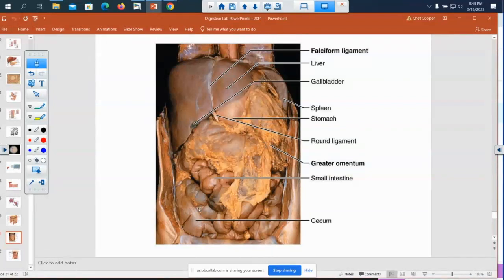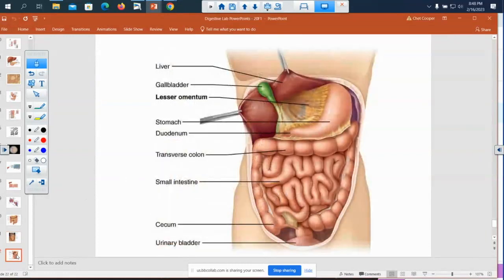Also, look how big, that's the large intestine across there. And that's the small intestine right there. So obvious why they call them large and small, right? When you see that. It would look even better if they removed all that mesentery and cleaned it up for us, but they didn't. So the publisher said, well, I'll do it. And there he did. Okay. So there you go. This also shows that the gallbladder is hidden up under the liver, and there's another mesentery on that side of the stomach. And it shows how high up that transverse colon goes.